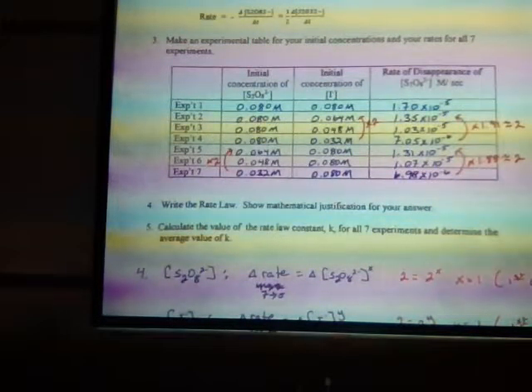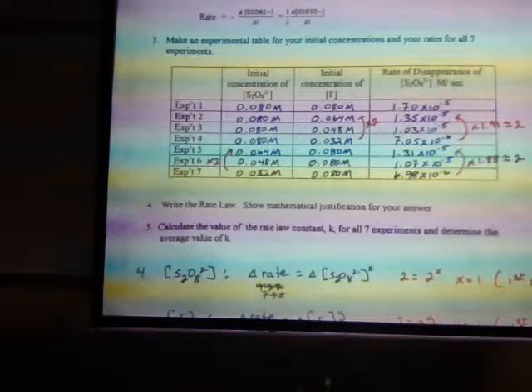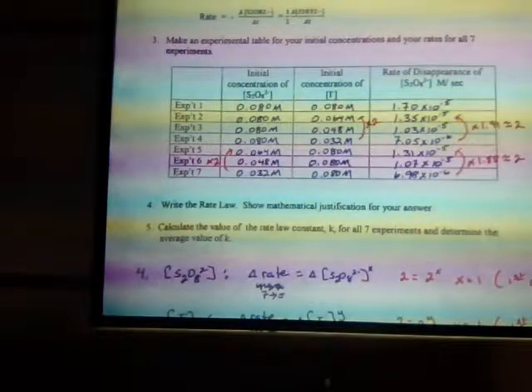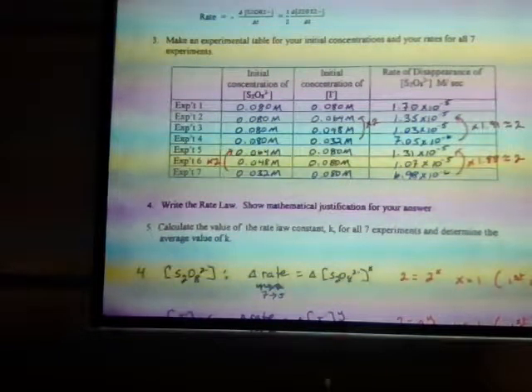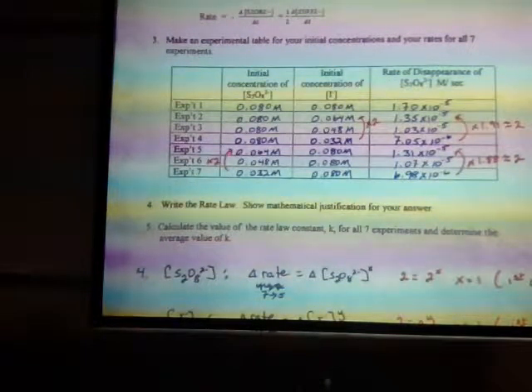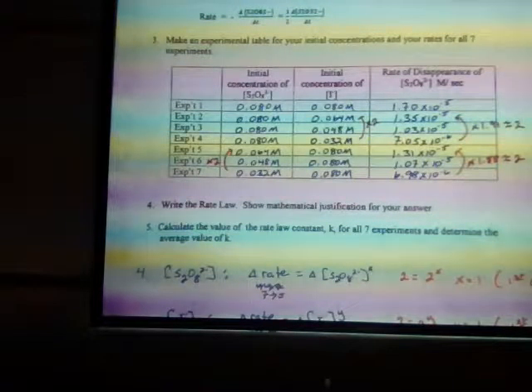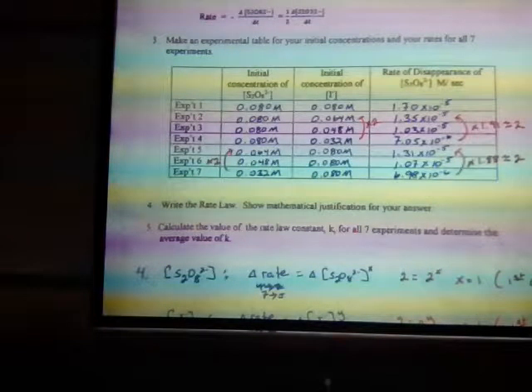Now, Macy asked a great question. Why didn't everybody get the same time? It's supposed to be a clock reaction. We all use the same stuff. Why is it different? We use the exact same amounts. Okay? Because some of y'all didn't read the bottom of the meniscus exactly right. You might have been a little bit above, a little bit below. What else?